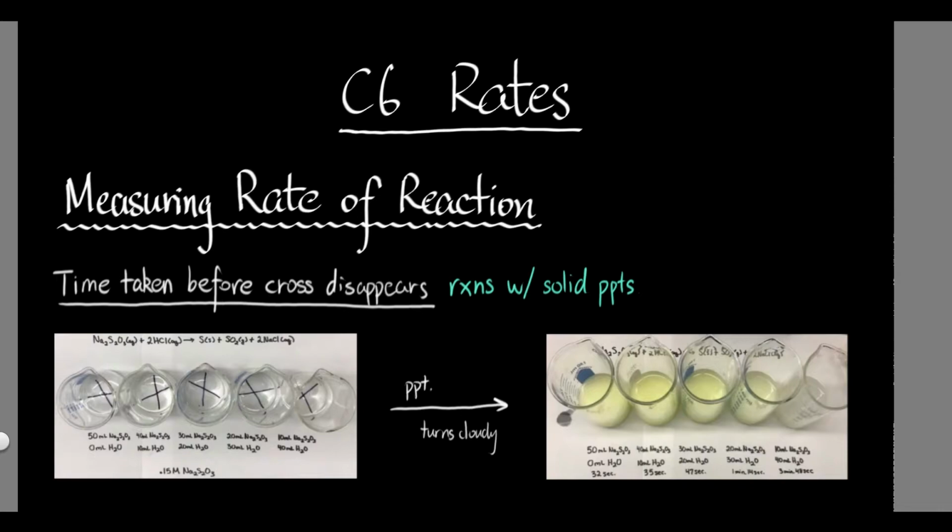So it would be very obvious which one of these is which, because for how much product, we usually use some kind of measuring equipment, so maybe a measuring cylinder, because with a measuring cylinder, you measure it. And for how much time it takes, you usually have a timer. So depends on what we want to measure, we can have different methods for measuring them. So let's take a look at some of these methods.